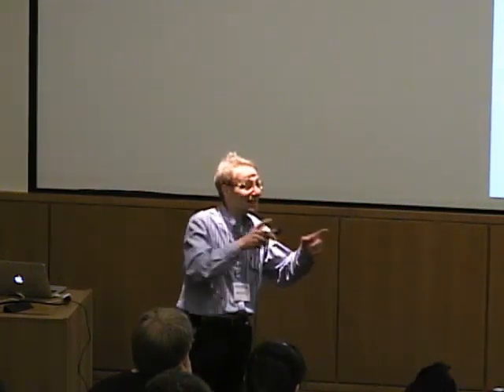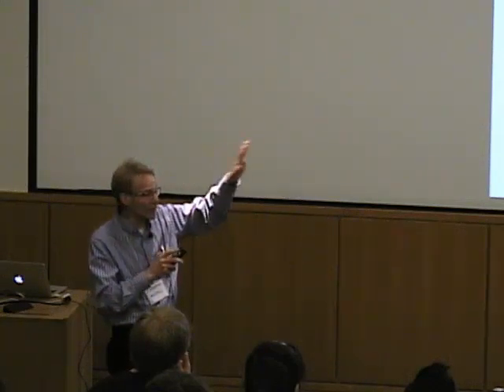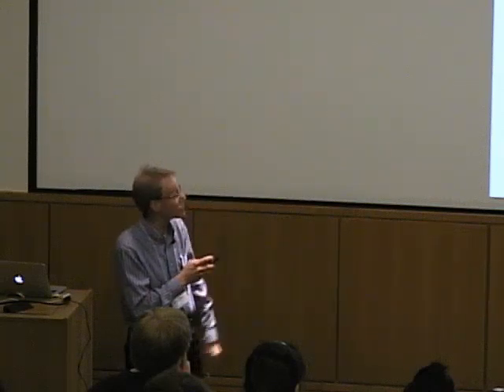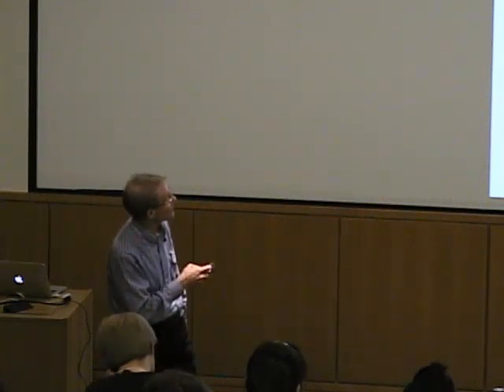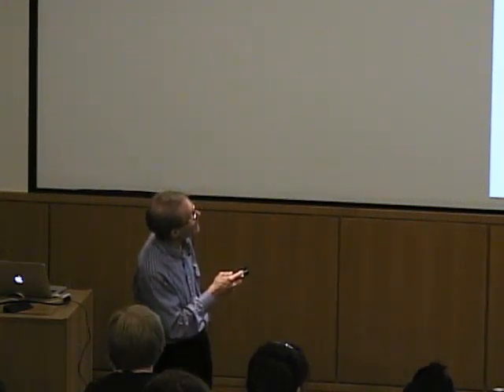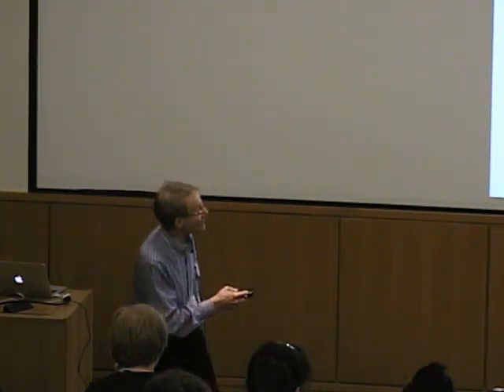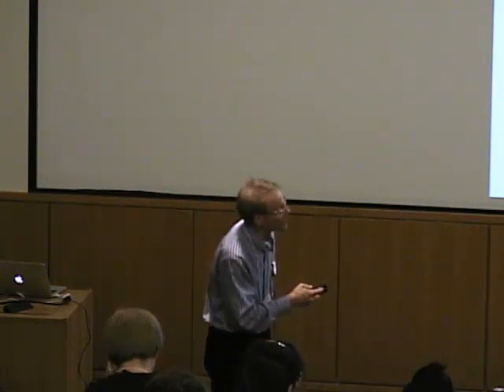To be expected? What's the reduction potential of the blue copper proteins? They're positive, about 300 millivolts, so you'd expect it would favor copper-1 over copper-2. All right, so overall stability, let's look at the thermodynamics. The enthalpy, enthalpically very favorable binding for copper 1, still entropically favored, but not nearly so.